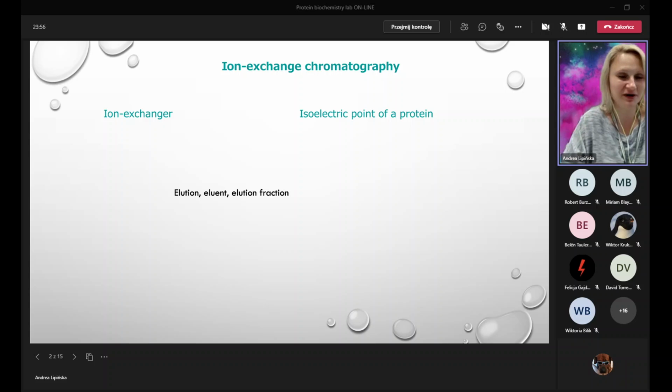It should be measured for all fractions so that you know how it goes. So, for example, you understand that you have lots of proteins coming in those big 2 fractions, or at the beginning of your elution, because we have, of course, different types of positively charged proteins in our sample, not only lysozyme, and they can be bound, but because they differ in their pI, they may be eluted in different fractions. But if you did it like that, then you just put those last 4 fractions in the graph.